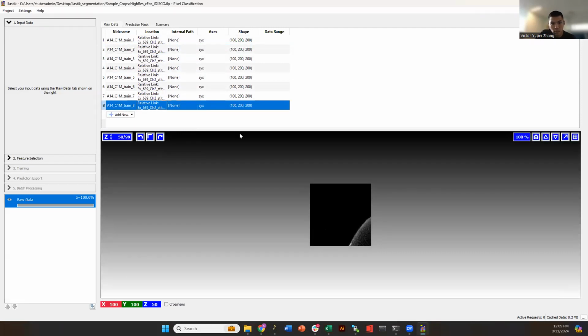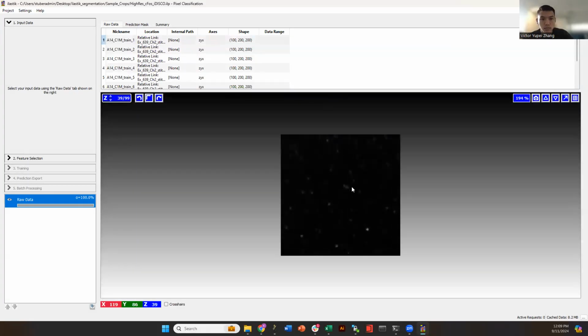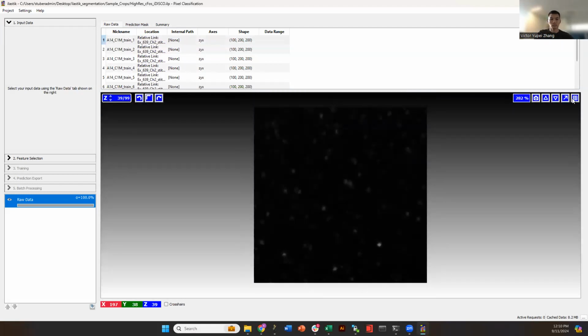So just first of all, confirm that. Ilastik also provides very useful visualization approaches. You can go through the Z positions like this. This is the XY view. It also has projected views, so now you're looking at the X-axis, now you're looking at the Y-axis. So you can see the signals in three axes. You can also focus on Z alone by using some of these visualization tabs.